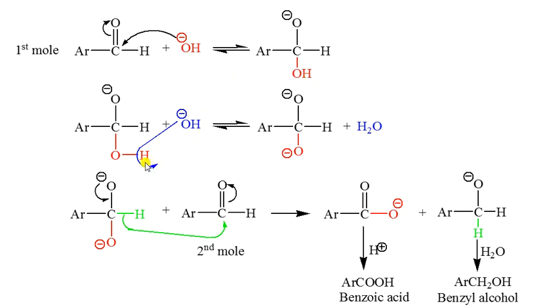This hydroxide will be deprotonated in the second step to produce a double charged intermediate, and this negative charge will reform the carbonyl group, and the hydrogen atom with its bond will attack the second mole of benzaldehyde, because here is partially positive, and of course break the pi bond of the carbonyl group.